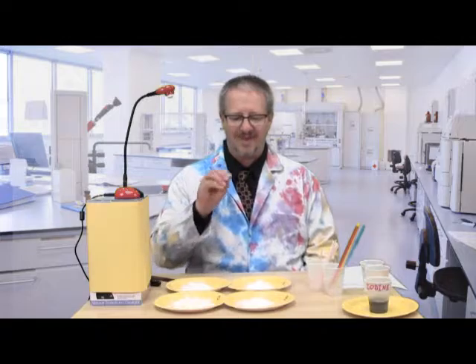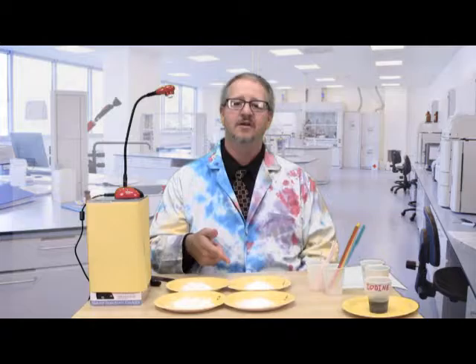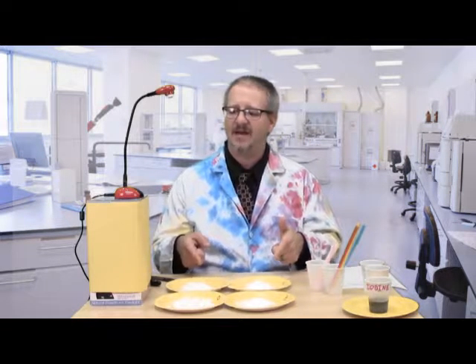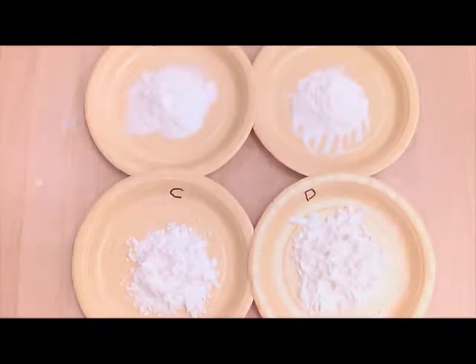All right, we are going to do the White Before Your Eyes lab right here, right now. So if you didn't get a chance to do this lab on your own, you'll be able to use my data from my demonstration of the lab for your lab report. Awesome. Okay, so you can see that I have 4 white substances here on the table. Can't quite see all the letters. There we go. So I've marked them.